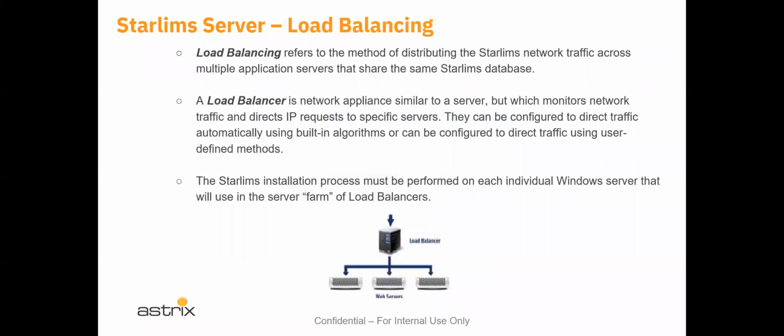So let's talk a little bit more about load balancing, just to make that a little bit more solidified in your minds, because you'll be running into them a lot. Larger companies, enterprise companies, use load balancing machines for a number of different reasons. One, of course, to alleviate the load on any one application server. Also, it allows for system redundancy.